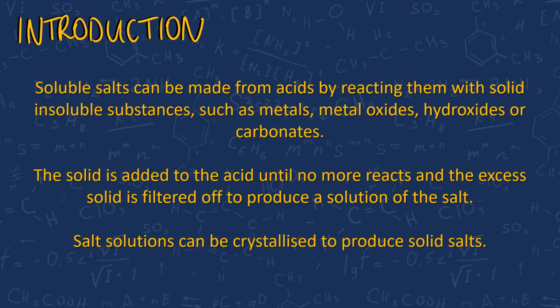The solid is added to the acid until no more reacts, and the excess solid is filtered off to produce a solution of the salt. Salt solutions can be crystallized to produce solid salts.